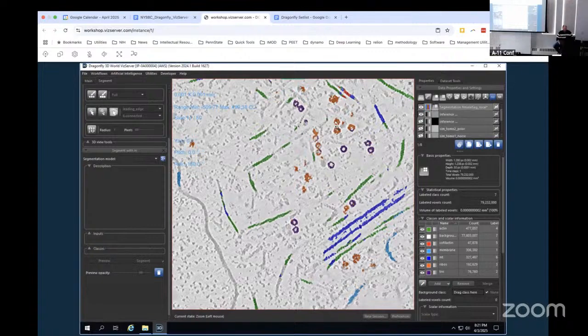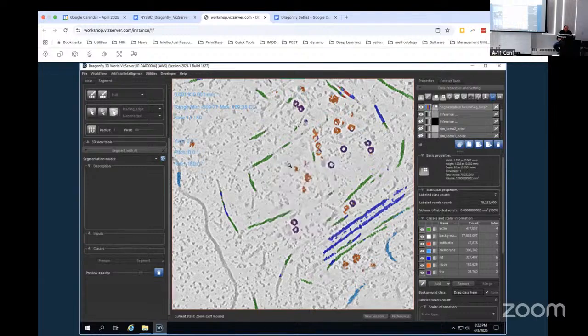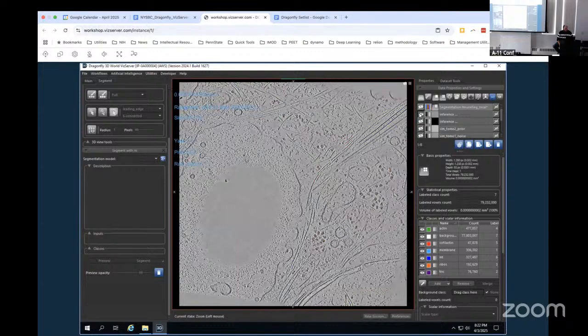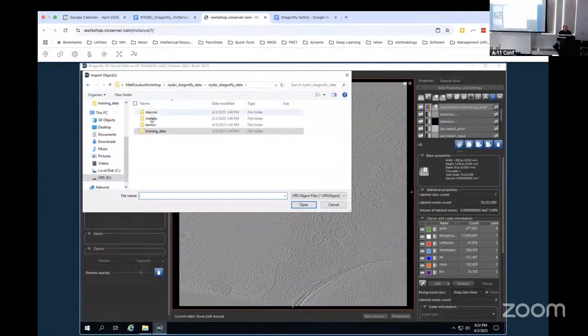Now, we could train a network that would be very good at segmenting denoised data, but it doesn't guarantee anything. Denoising, in my experience, does not guarantee it, at least not with our regression networks. I don't know what would happen with a gentler noise-to-noise. It might actually help quite a bit. If you do a very gentle regression, it also reliably helps all of them. But the network here is a kick in the face.